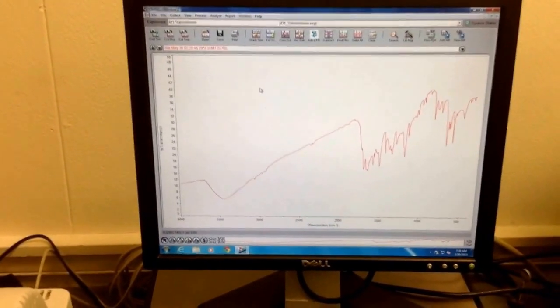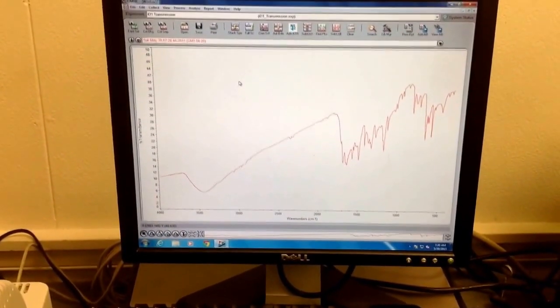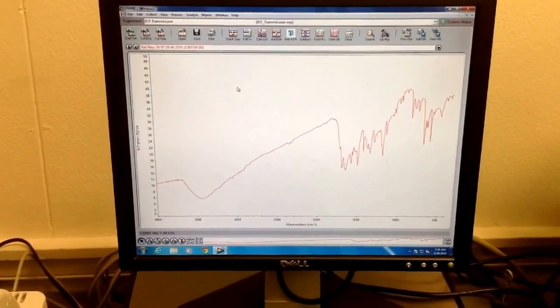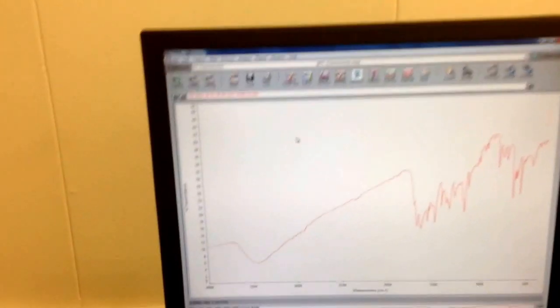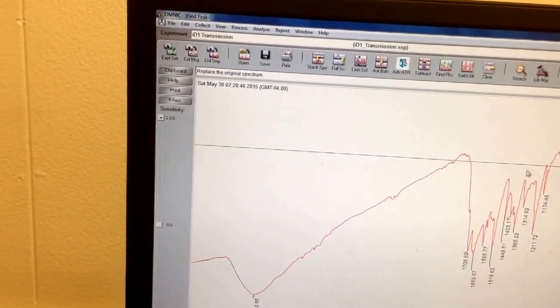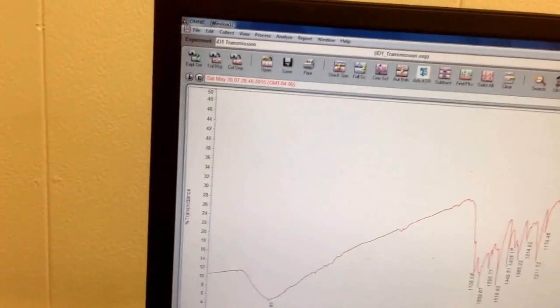Now I've taken this to percent transmittance, and we can see the spectrum. It does have an odd sort of shape that we can usually adjust with a baseline correction. But for now, I'm just going to go ahead and find peaks and label those for our molecule, for our substance. Let me tell that to replace.